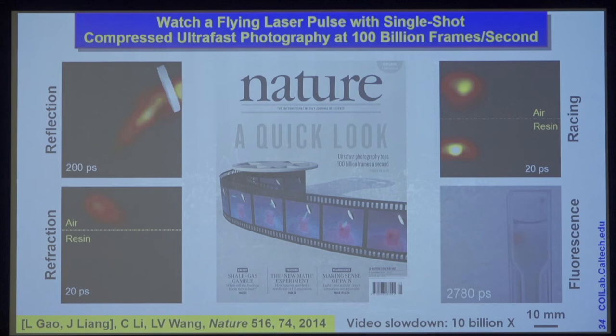And this is single shot fluorescence lifetime imaging at two different colors. So we changed our camera to a color version. You can see the excitation pulse, which is green, and red is fluorescence decay. The fluorescence only happens within nanoseconds, but we have picoseconds type of resolution, so that feels like eternity. You can think of many applications. You might have heard of FLIM, fluorescence lifetime imaging, and we are doing single shot FLIM.